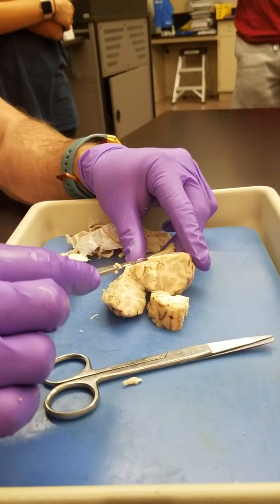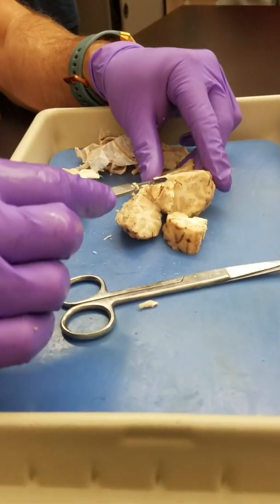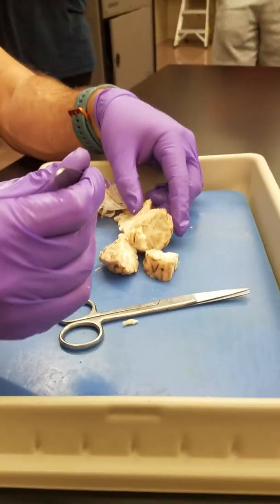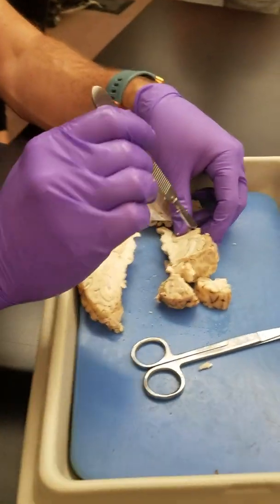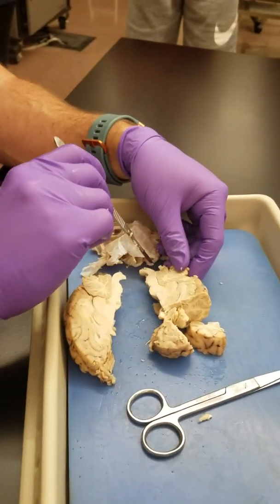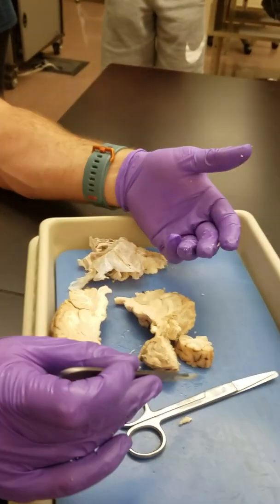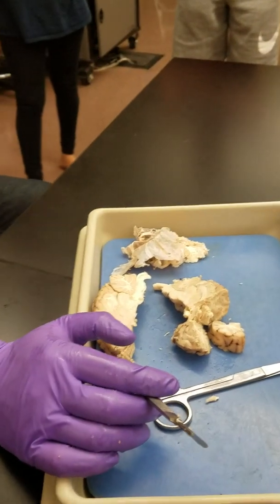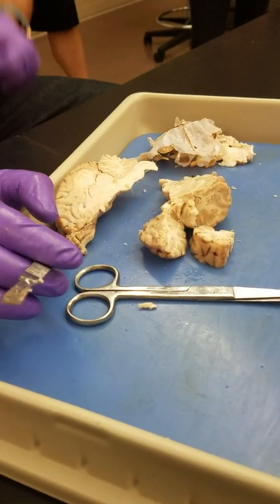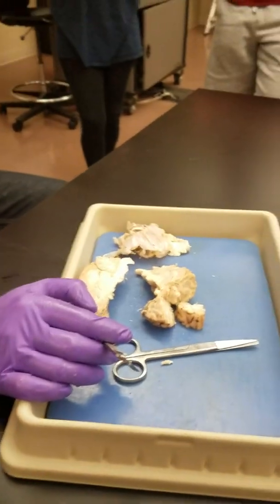So see how it's faintly pink here. Right? So that is the choroid plexus. That's what actually produces the cerebral spinal fluid. So you have the two lateral ventricles. Then you have what's called the third ventricle, which is right here. This is called the cerebral aqueduct, and then here is the fourth ventricle. Okay, so it goes down the brain through the spinal cord, gets to the bottom of the spinal cord. There's a hole in the spinal cord called the central canal, and then it goes back up through the spinal cord. So the cerebral spinal fluid is constantly circulating.